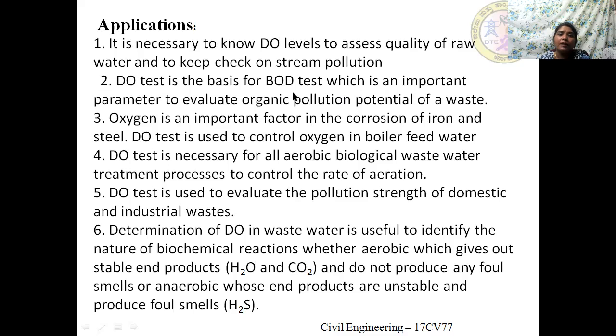Moving on to the applications, it is necessary to know the dissolved oxygen levels to assess the quality of raw water and to keep a check on the stream pollution. Because when DO is in sufficient quantity, the water will be in a sparkling blue. So we can say it is fresh. But the water which has less DO will not be so appealing.